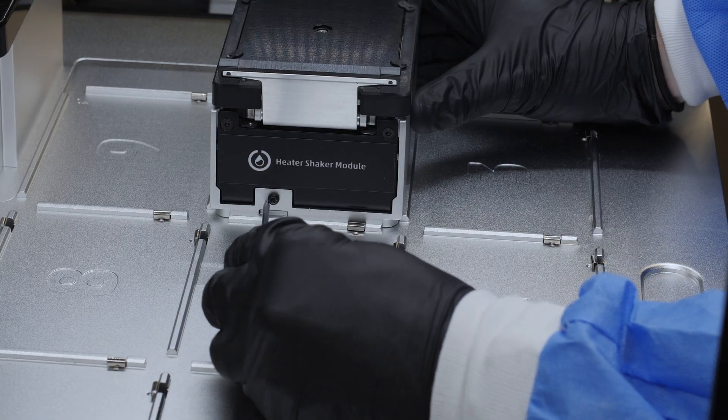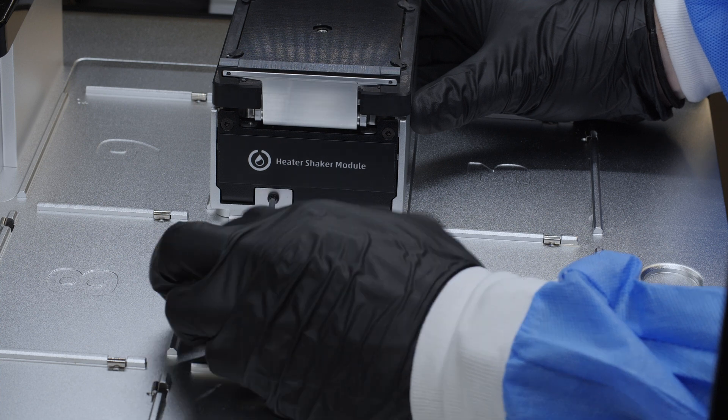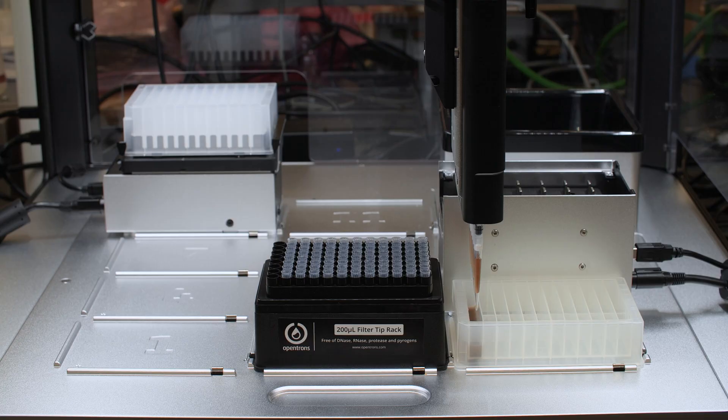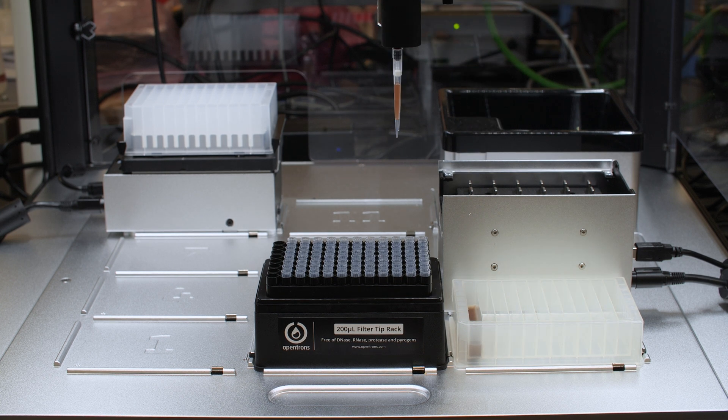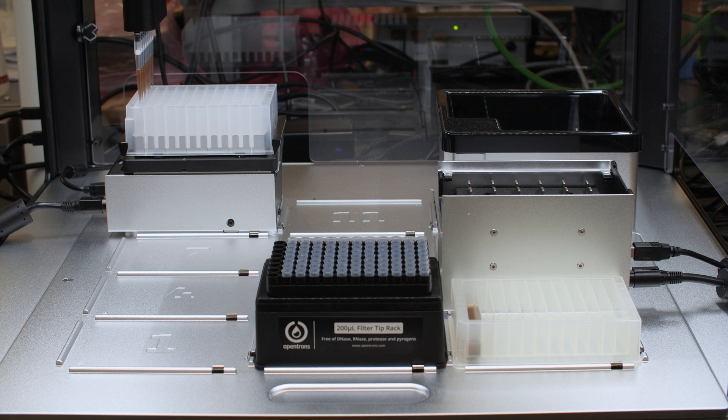Two anchors attach the Heater Shaker securely to the deck, ensuring the module's stability. It uses specially designed thermal adapters to support different ANSI SLAS compliant labware and ensure uniformity of temperatures across samples.